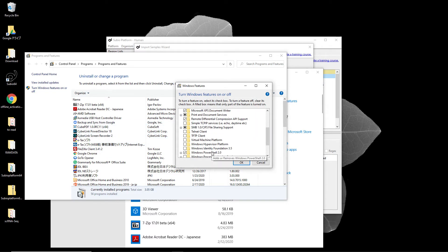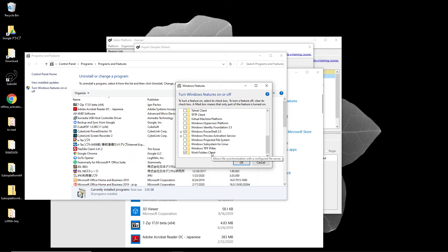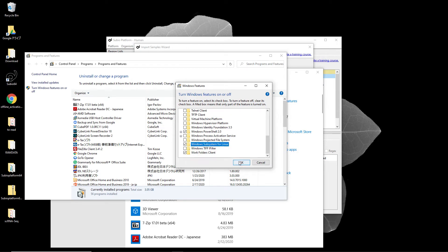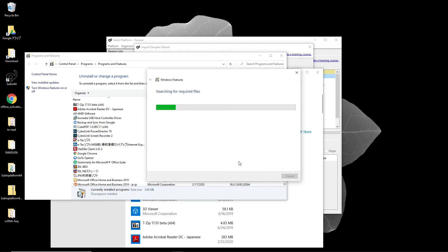Check on the Windows subsystem for Linux. Wait until Windows is preparing and restart the computer.